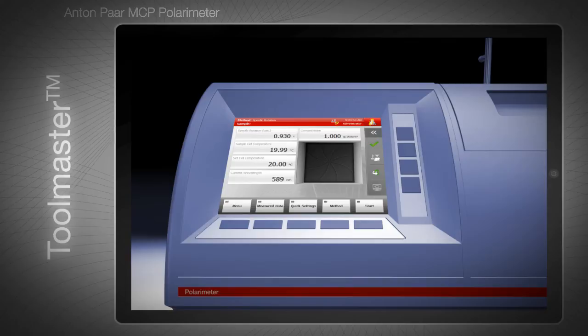The intelligent MCP sample cells do not require batteries or external power connections. Thanks to the wireless RFID technology, they are sealed and waterproof, making them ready for a long life in the laboratory.